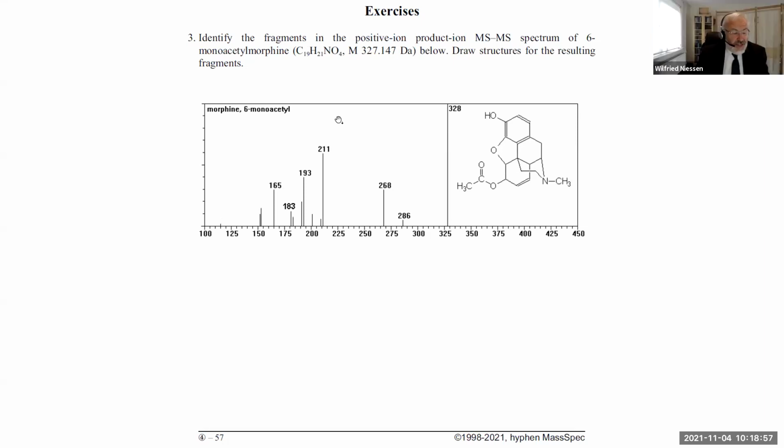But of course, calibration of the m/z axis is important. That's for sure. Okay, let's move to number 3. Anyone? Maybe I can try again. Nobody taking the chance.